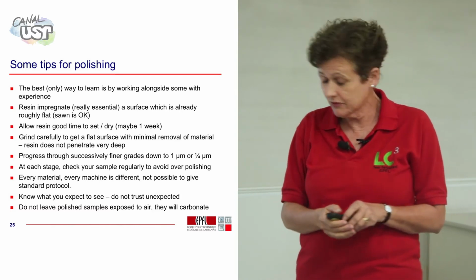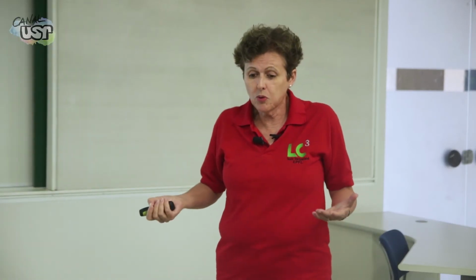You can't recover it. And the problem is, people say to you, how do you polish your samples? I can tell you how we polish our samples, but every material, every machine is different. So I can't give you a standard protocol. You have to look at it yourself, and you have to know what you expect to see. Do not trust the unexpected.